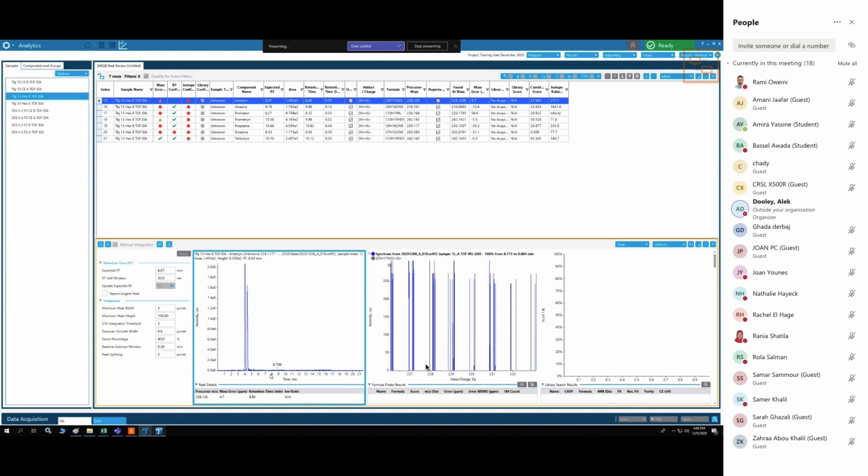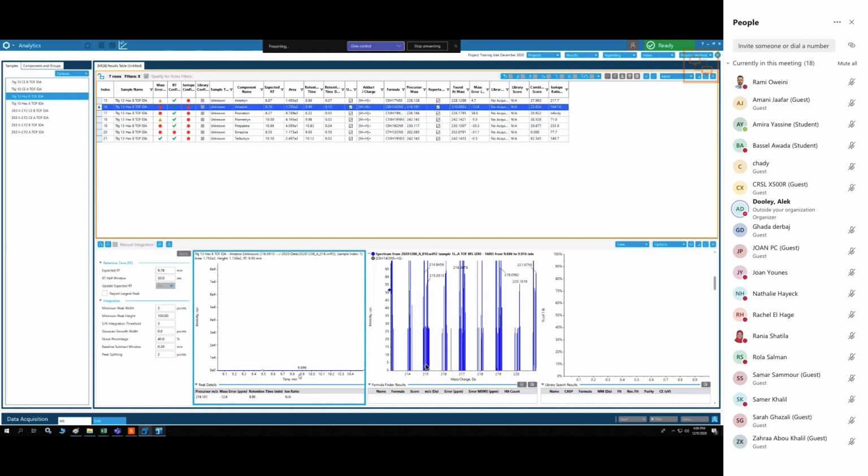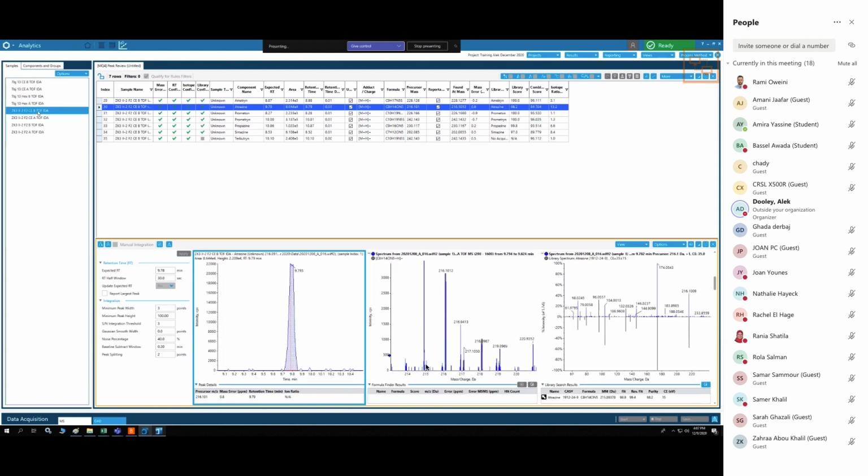Why are the peaks so different from time? And look, that's even more separated. Something interesting going on. Why am I seeing my peaks at such a different retention time? Who knows which sample I set up? This is correct.